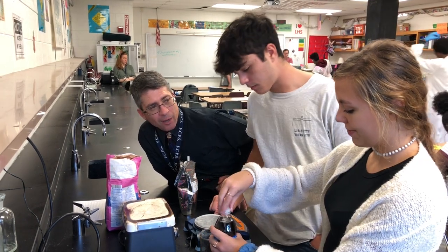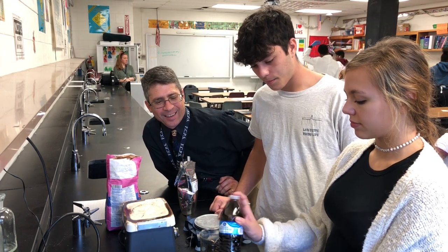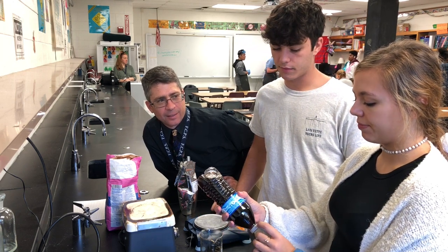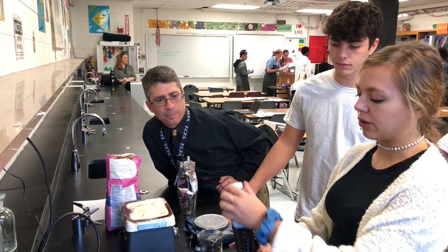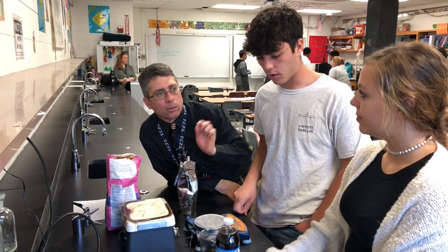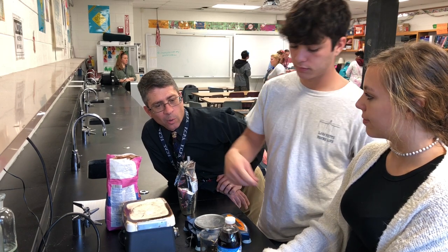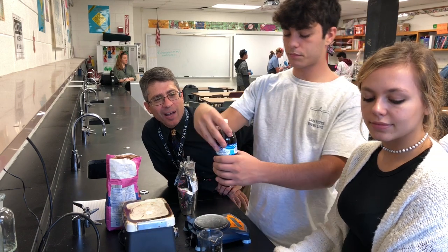Looks pretty gross right now, I'm not gonna lie. Not too appetizing. Just mixing it up. Okay. And then we're gonna hold it down to make sure there's not any space in the cap. That way the CO2 can build up, to be sure the CO2 doesn't leak out some pinhole. Okay. And that's all we do until tomorrow. Yep, we let it sit. We're going to be back tomorrow to test the taste of the root beer and see what it's like.